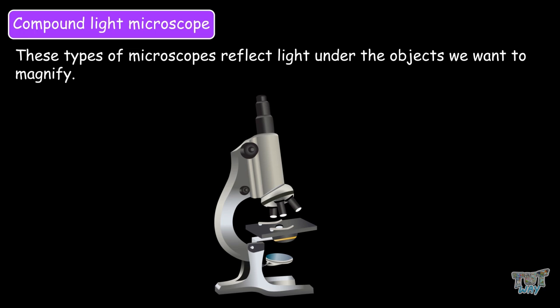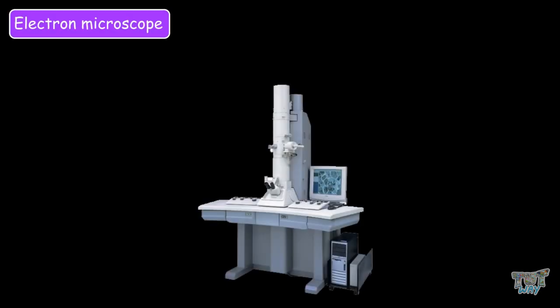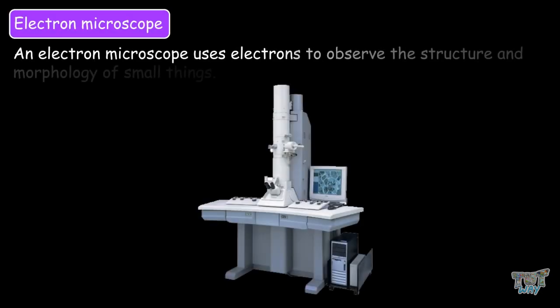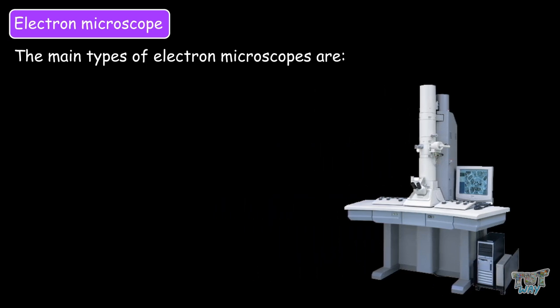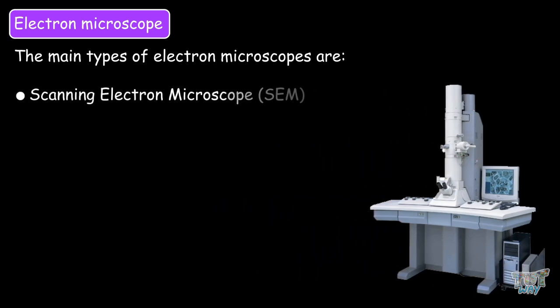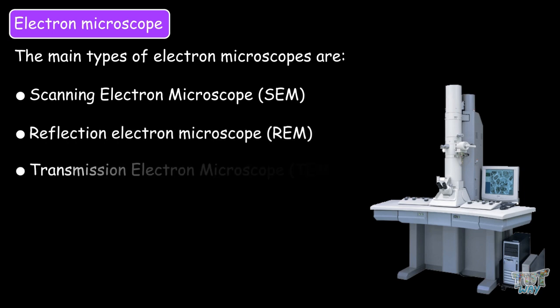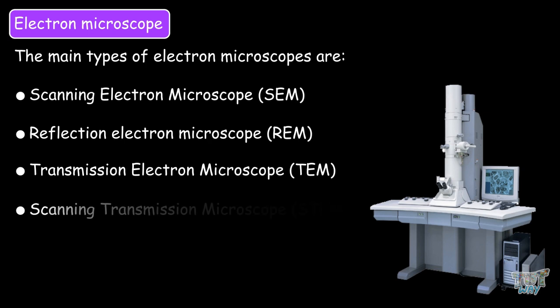Other types of microscope is the electron microscope. An electron microscope uses electrons to observe the structure and morphology of smaller things. The main types of electron microscopes are scanning electron microscope, reflection electron microscope, transmission electron microscope, and the scanning transmission microscope. So these are all the types of electron microscopes. They are highly advanced microscopes.